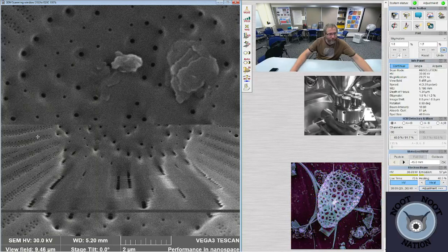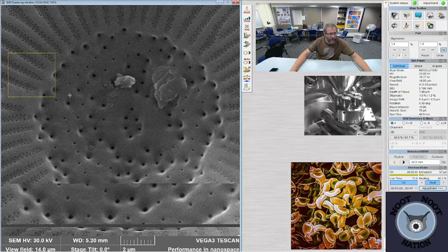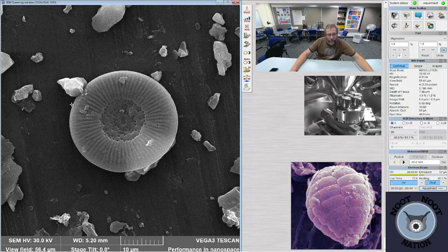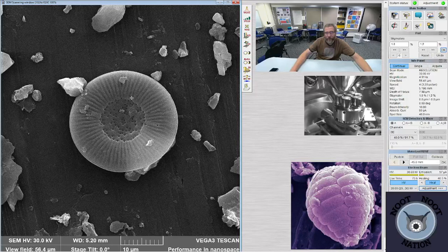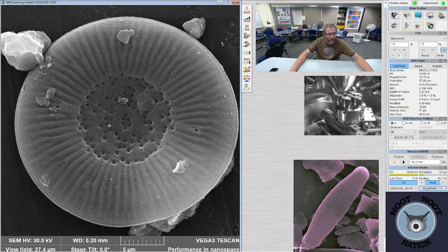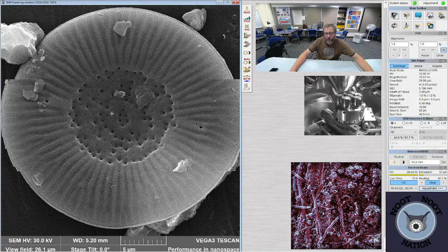The outside doesn't have a lot of the same access to the processes that you would see in the internal view. So everything in our field of view right now is about 50 microns. That's our field of view, like 56 microns, or a magnification of about 5,000 times. And if I zoomed in so that this diatom, this Lindavia intermedia, as I mentioned, is in the center of our field of view, such that it's taking up the entire image, this is about 10,000 times magnification right there.